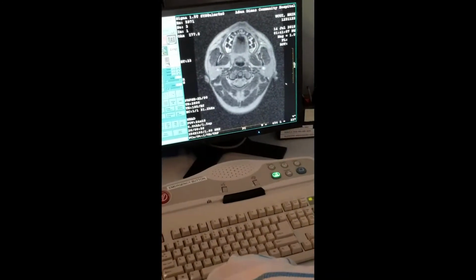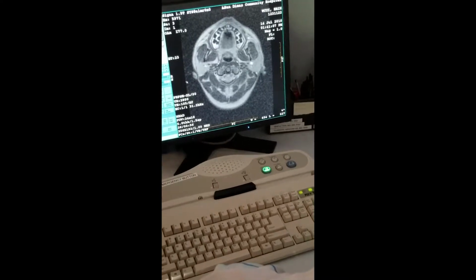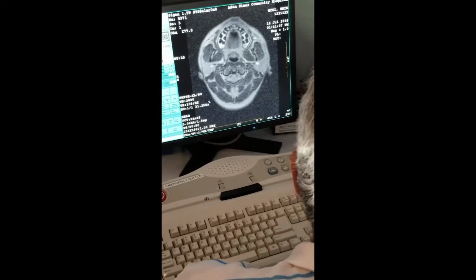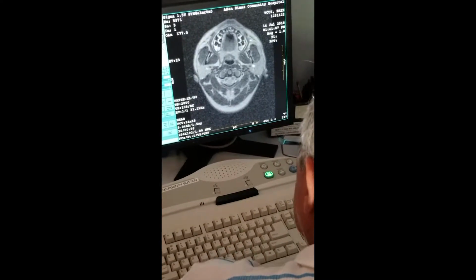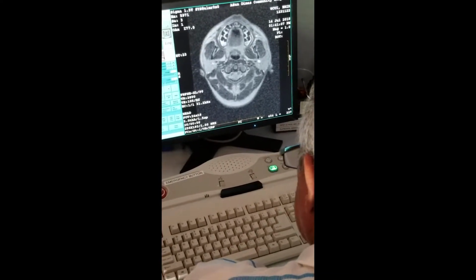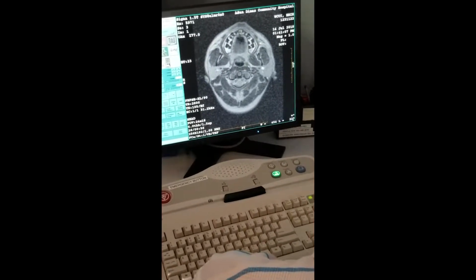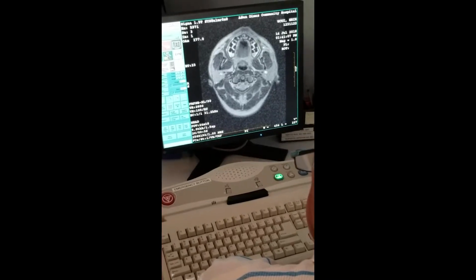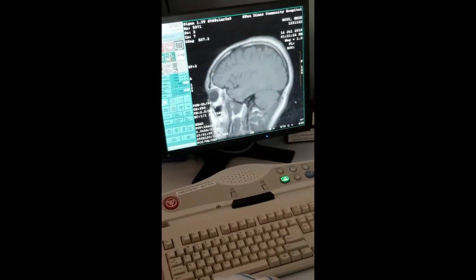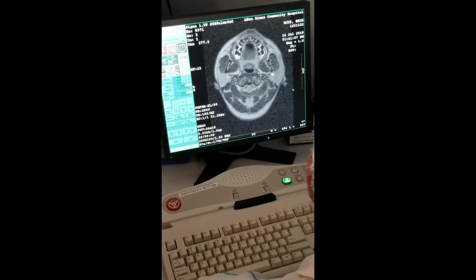You see this line? Yeah. You see this line? Yes. You see here? Yes. If you would have put one phase field of view, this was your entire collective area. You see my arrow? Yeah. But like this. See? Is there a line? No. But there is a line here. We don't want that. That is phase field of view.